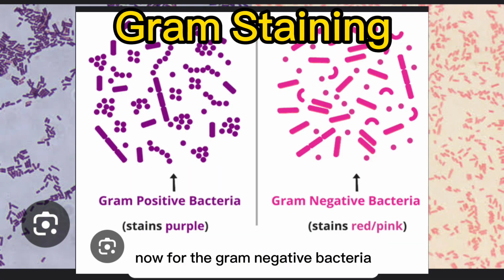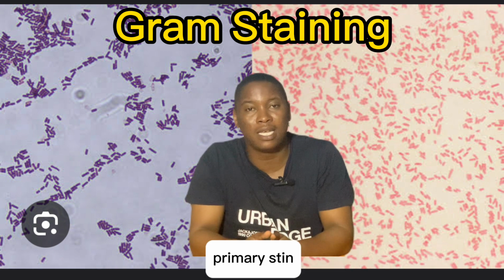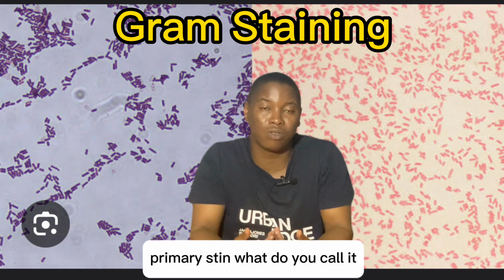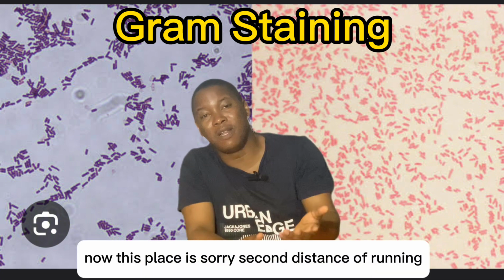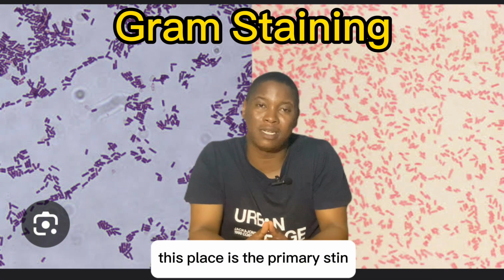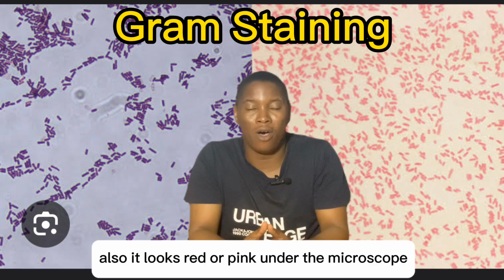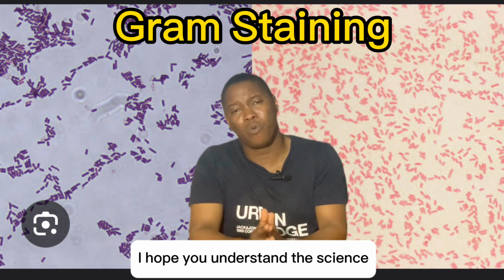Now, gram-negative bacteria have a thin cell wall, so they are not able to hold on to the primary stain. The secondary stain, safranin, displaces the primary stain, and so it looks red or pink under the microscope. I hope you understand the science.